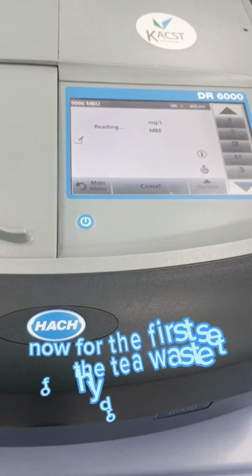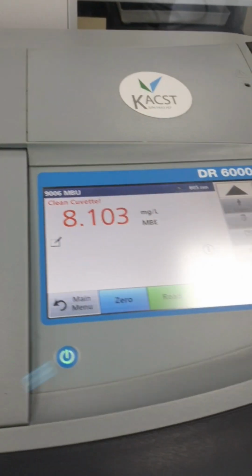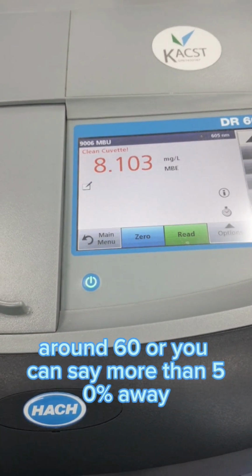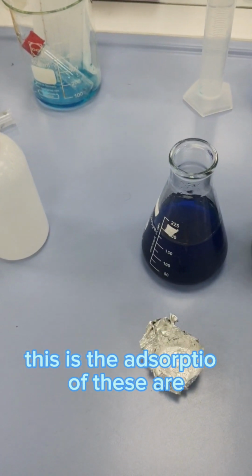Now for the first set, for the tea waste hydrochar, it's almost 0, and for the pozzolana, it is around 60, or you can say more than 50% removal. The next task is to desorb this. We did the adsorption, now we will desorb.